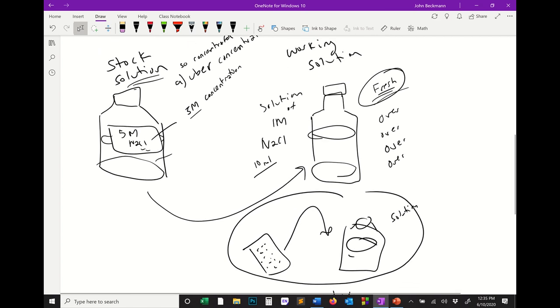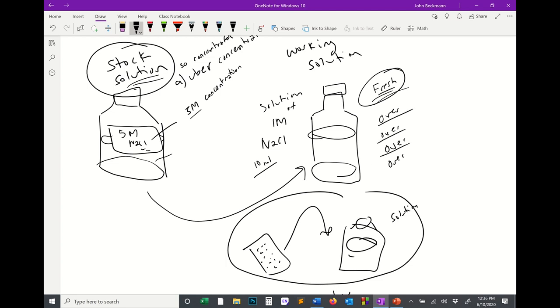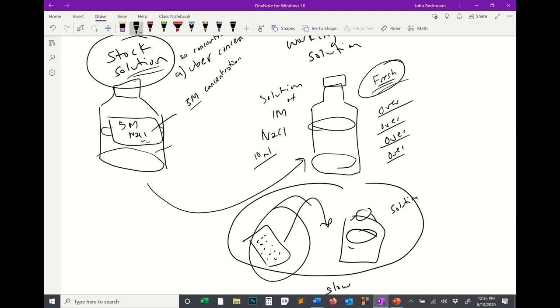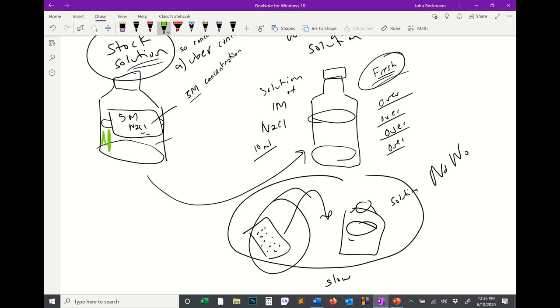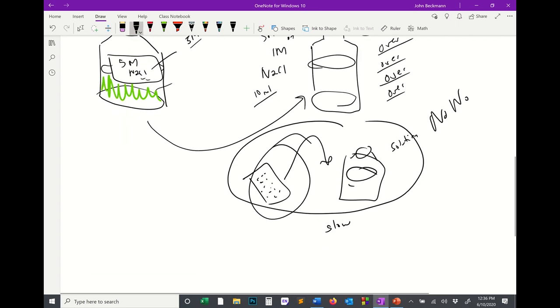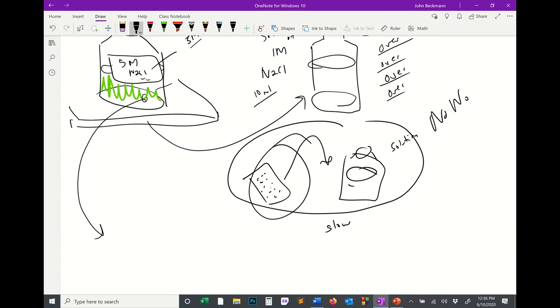So the reason we make these stock solutions is so that when we need to make things over and over again, we don't make it from the powder. No, no. What we do is we take the more concentrated stock solution, which sits on our bench, on our little shelf above our bench. And we just take a little bit of liquid out of that, and we can dilute it to our working solution down here.